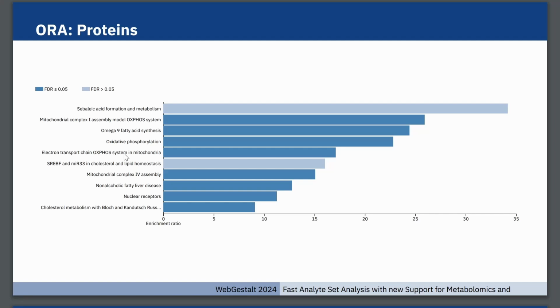What we have done in the past is find the protein that the site is located on, and then put it into WebGestalt as a protein. We're working on a lot more to actually use the site information to drive something. But for now, the easiest way would be to remove the site information, resolve it up to the protein, and then give it for enrichment analysis if you want to do a multi-omic comparison. And for the non-proteomics people, PTM is post-translational modifications.